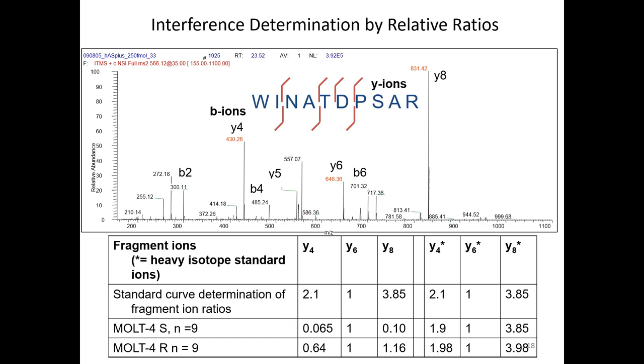Now, that's just in solvent matrix. When I go into more complex samples, I see that, wow, these numbers are not matching the 2, and these numbers are not matching the 3. But my standard is coming pretty close to what is predicted.